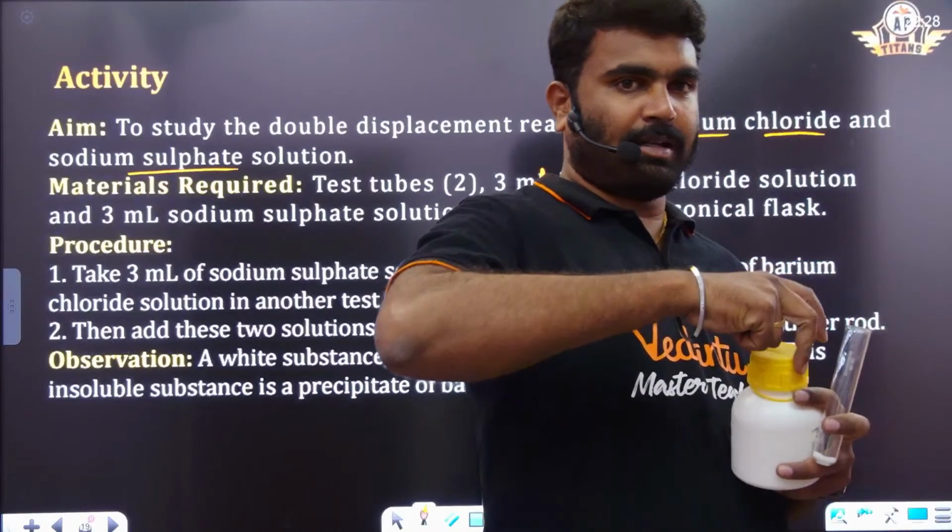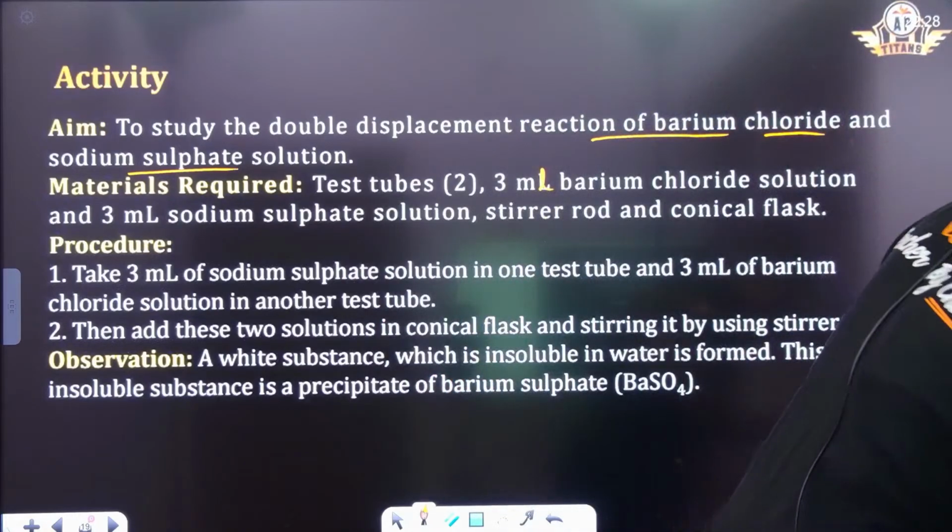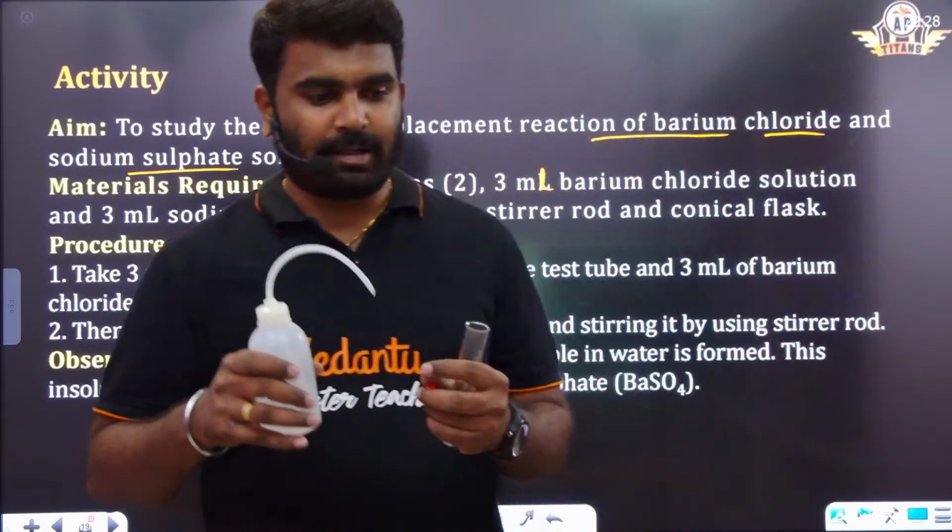Hi JE aspirant girl. So I am taking sodium sulfate in one test tube.